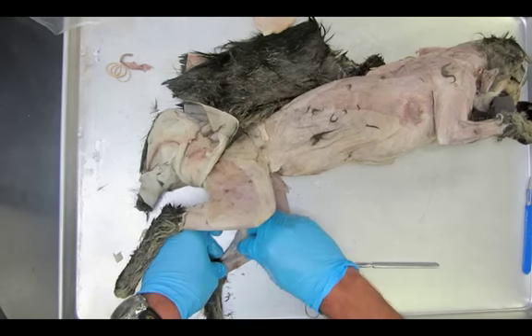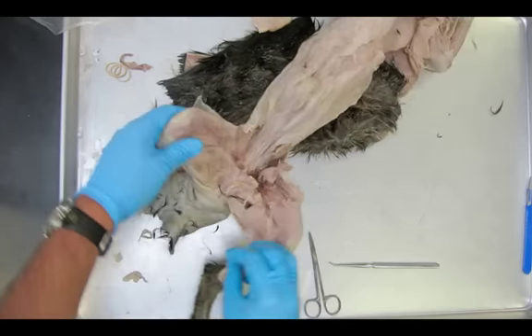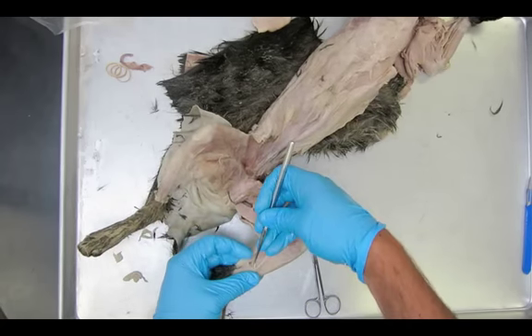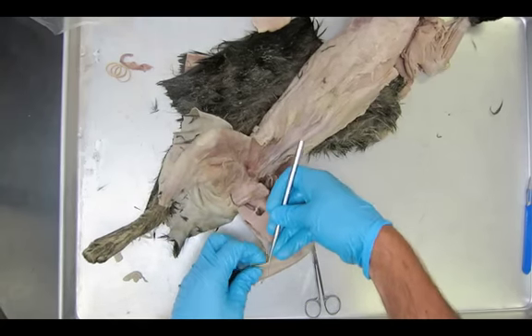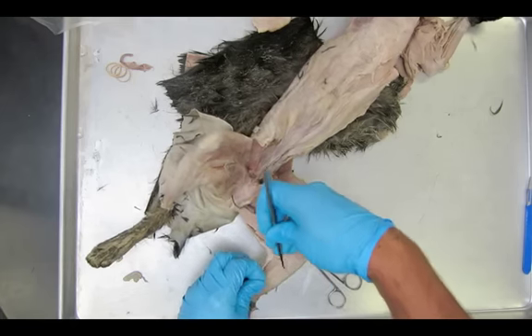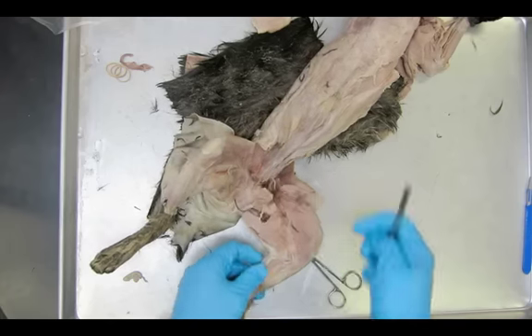Our first muscle we're going to locate here is the gastrocnemius. It's a big calf muscle — basically what we would call your calf. We now know that a lot of those muscles we know so well, like the hamstring, quadriceps, and calf, actually have much more scientific names.